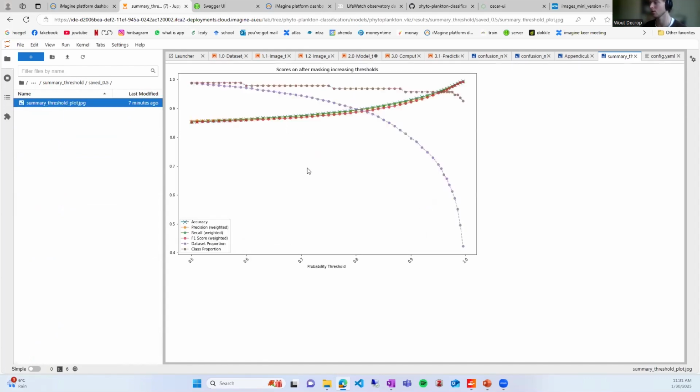So this is just showing this for one class, but we've also made this figure in general for all of the images. And again, if we look at an 80% threshold, so we need at least 80% confidence, we lose 10% of our data, which is now this purple curve, but we do get a little bit higher performance. And if we keep following this threshold curve to the right, we can see our model is more and more correct because it is more confident, but we do lose data where we are not confident.